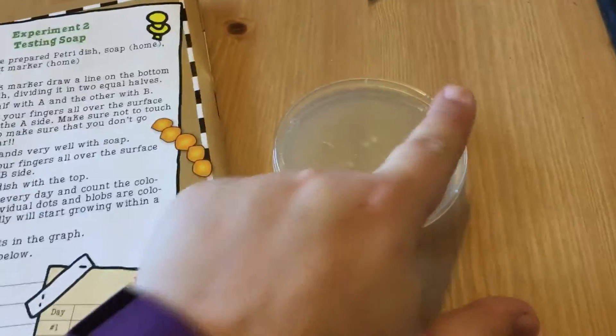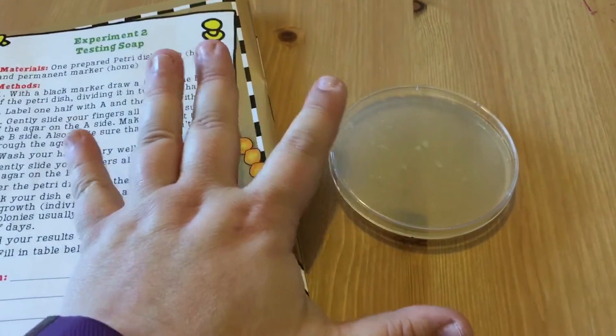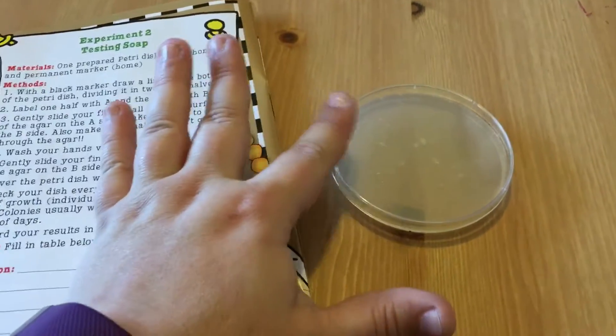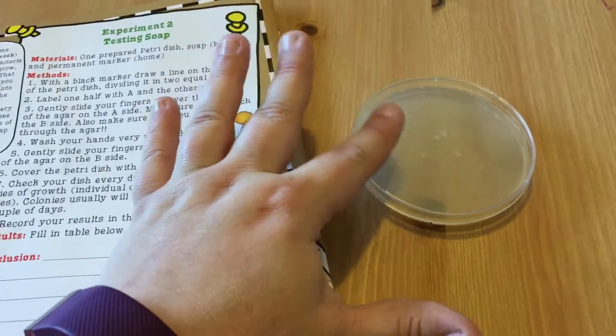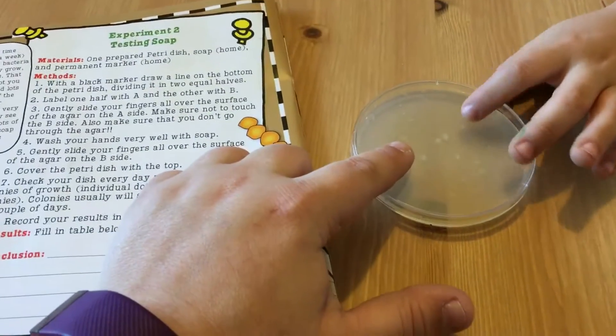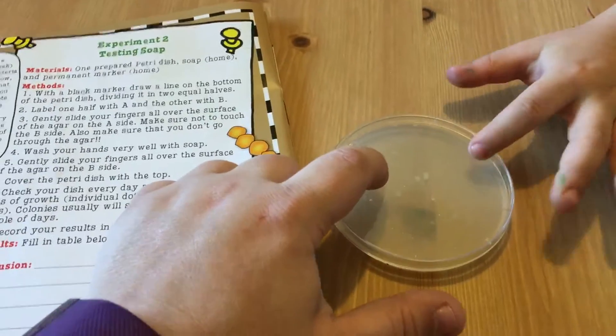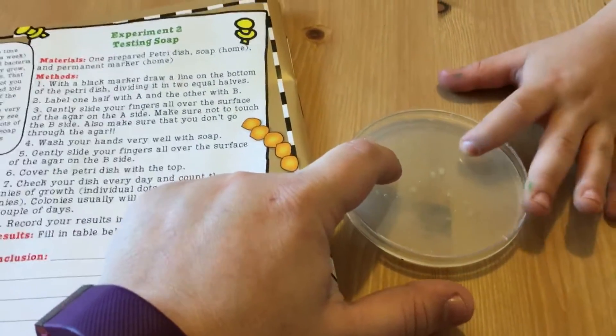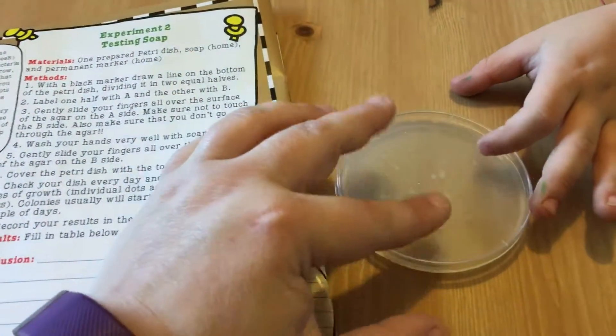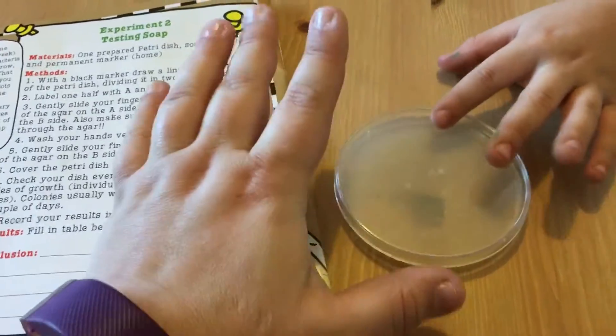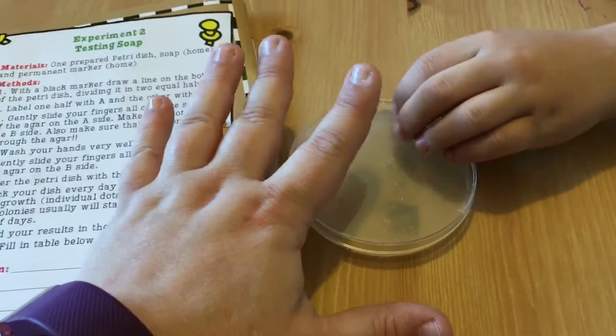On side A we're going to take our hands the way they are and just gently rub our fingers over the top of the agar. Now remember the agar is kind of like jello. You do not want to push down because you're going to ruin the experiment. So you gently glide your finger over the A part. Then we're all going to wash our hands with soap and rub our clean hands over the B side.